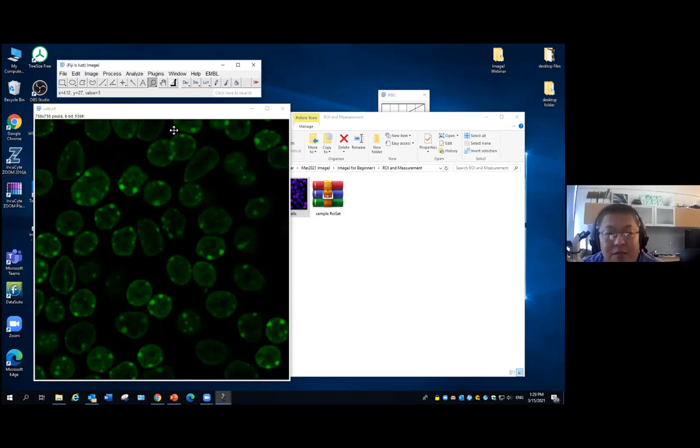Eventually, I want the software to do it for us automatically. That's the job for tomorrow, for the beginner tool. For today, we'll go the hard way. If we cannot do it automatically, we just do it manually.